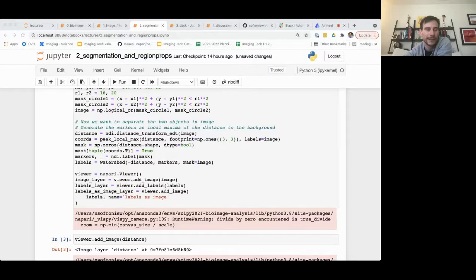This is a napari labels layer where we've got a 0, a 1, and a 2. So as said before, labels are really integer images. And then I can convert that to just being a black and white image as well. And you can just sort of view that interchangeably too.